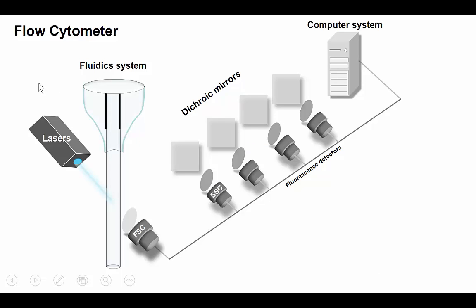Let's study the flow cytometer. Let's analyze the word flow cytometer. Cyto is cell, meter is measuring, and flow is flow. So we are measuring the cells in flow. In this system, we make a flow, and then along that flow, we flow the cells. And by giving light, we measure those properties.